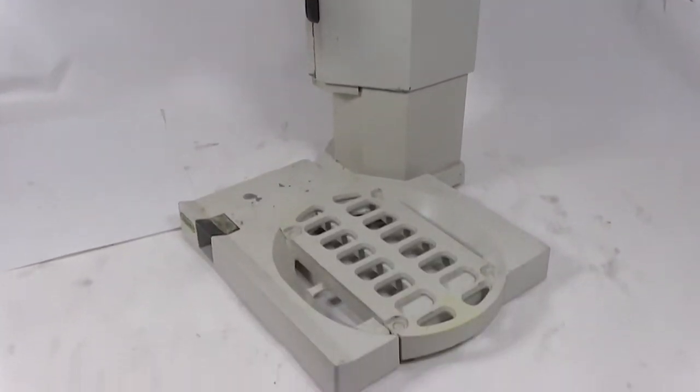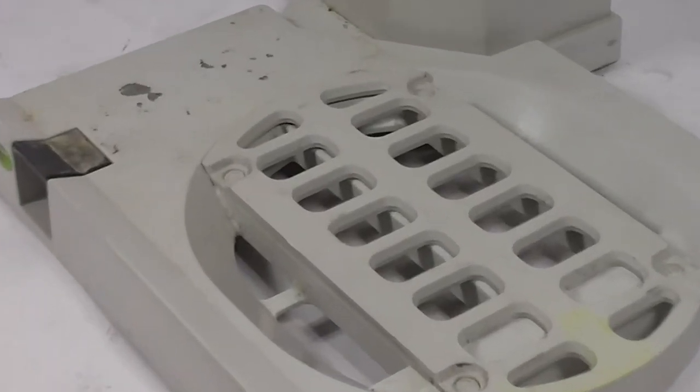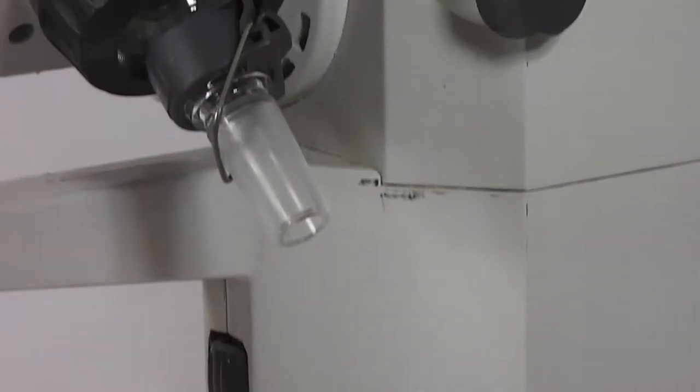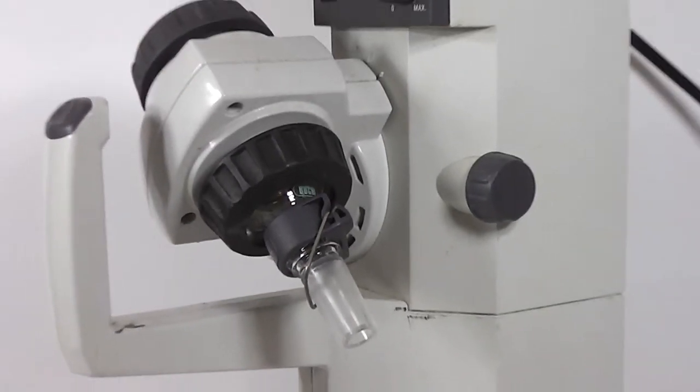It's got some flaws and cosmetic imperfections - scratches, wear, and stains. I'm going to zoom into the action there.